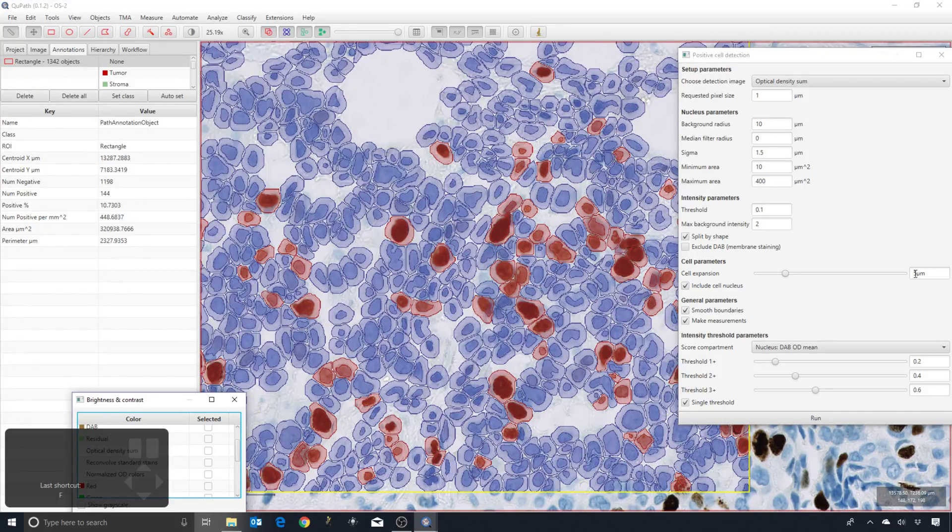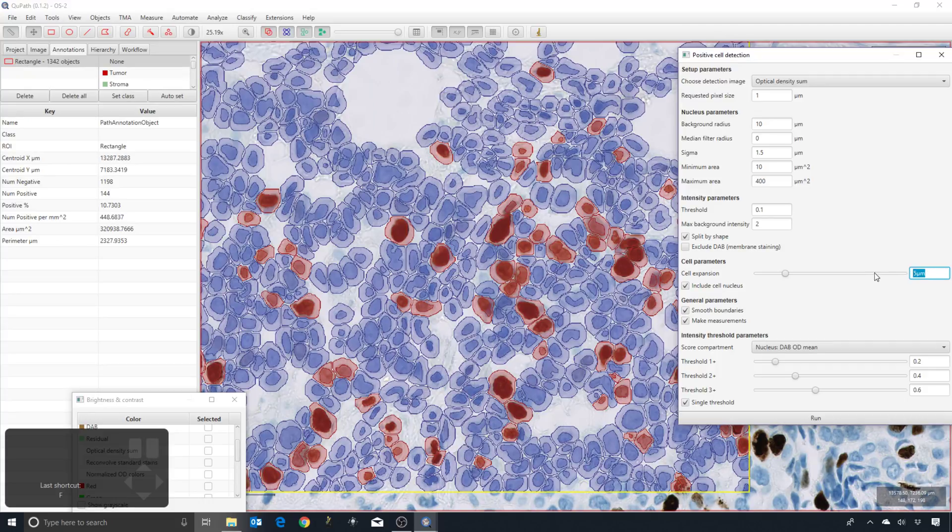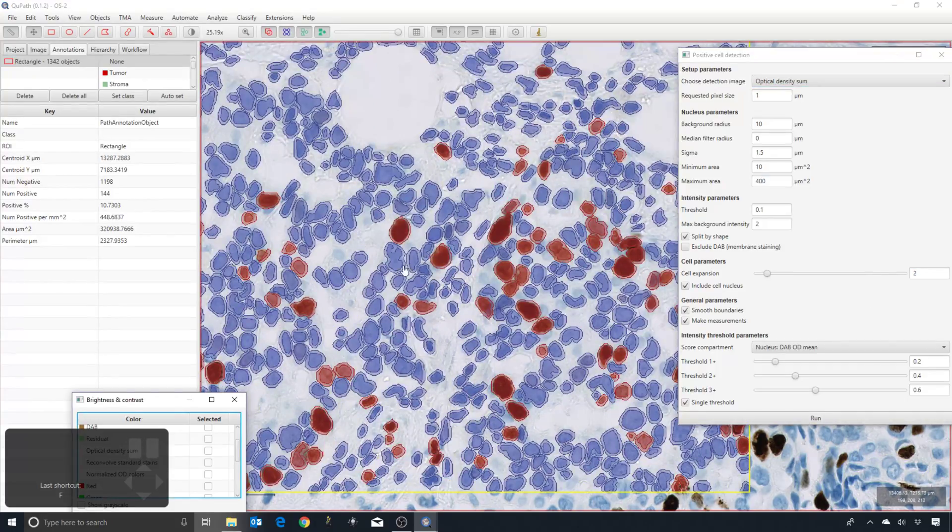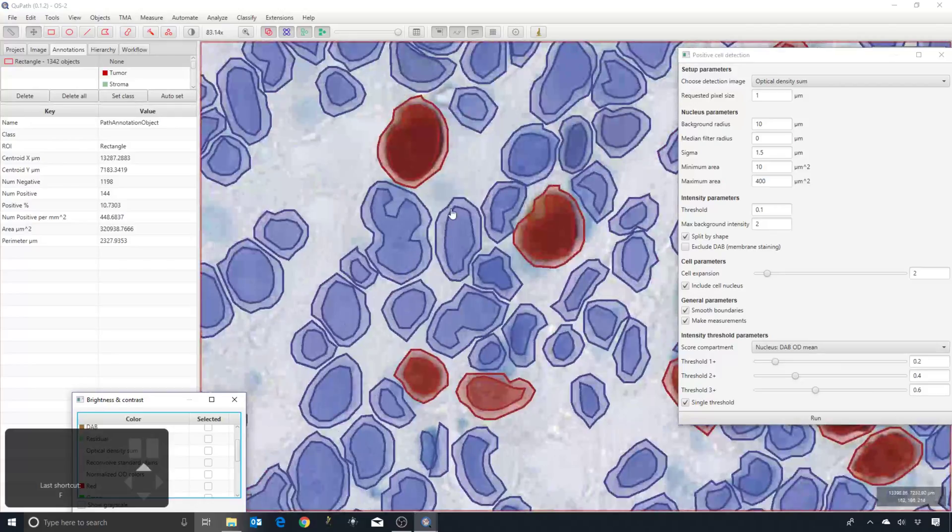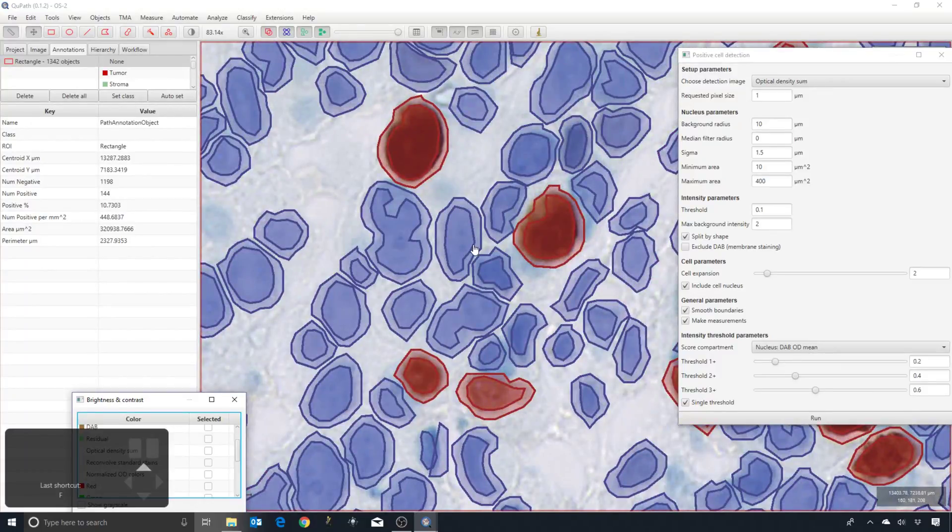In that case, if I make this a very low value, then our measurements are made just in a small ring around the nucleus.